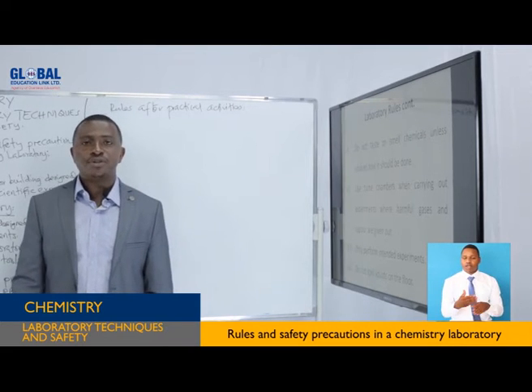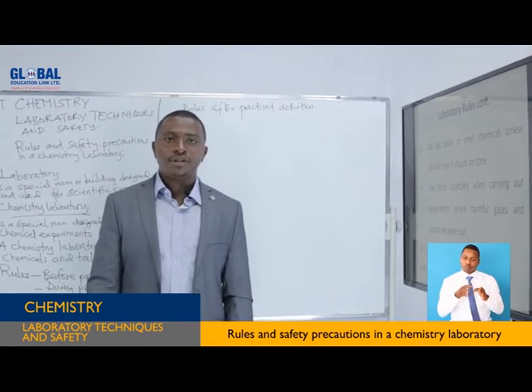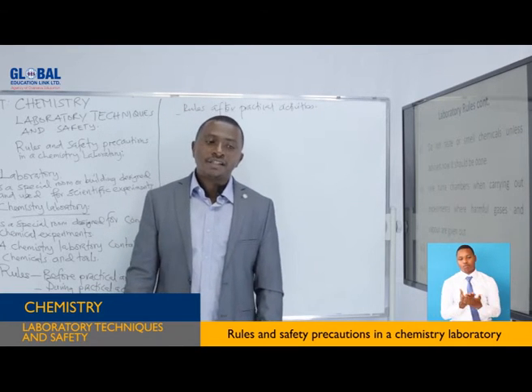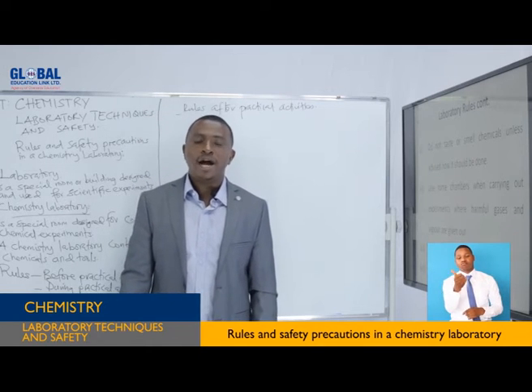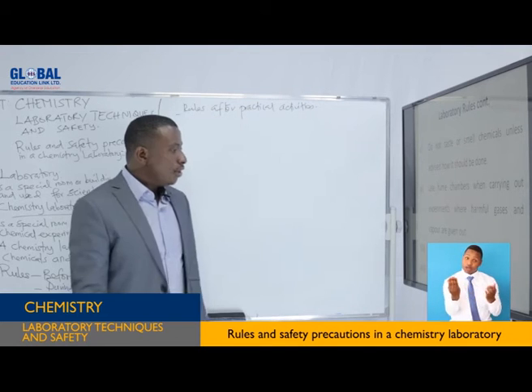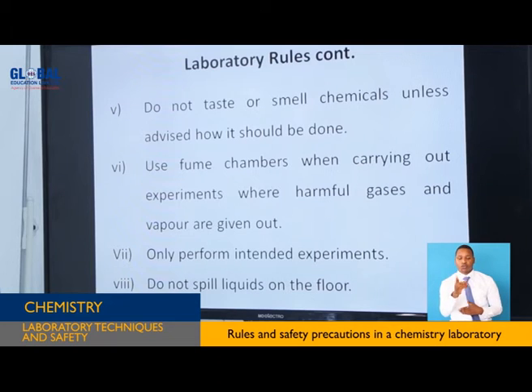You go to the laboratory with the special purpose of conducting a certain experiment. You go and perform that intended experiment. It's because conducting unintended experiments can lead to some accidents. Are we together, students? Also, do not spill liquids on the floor.